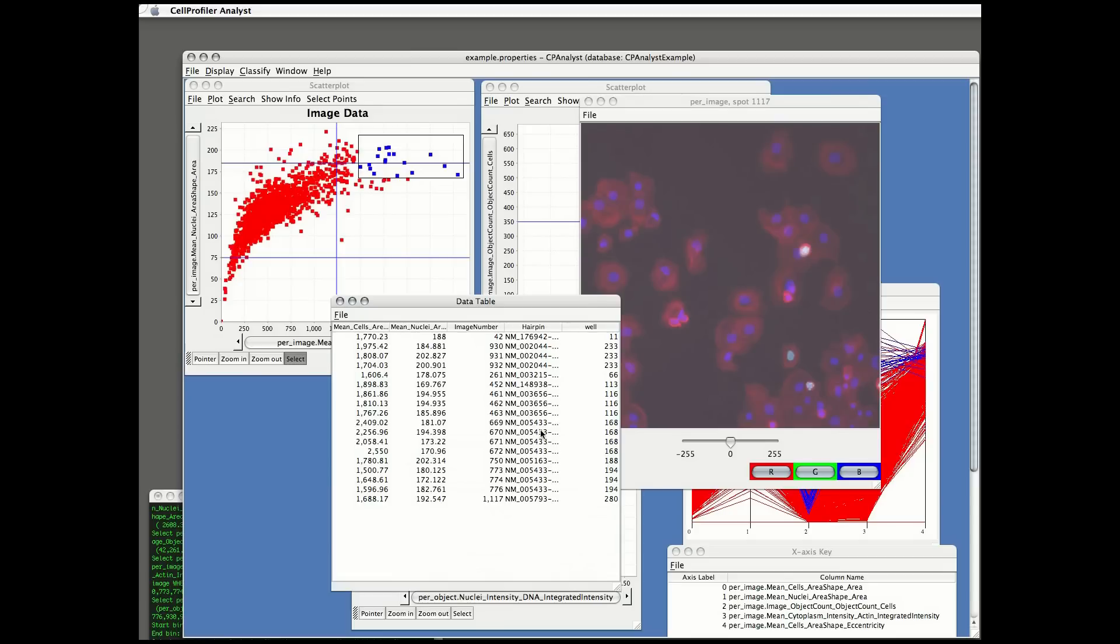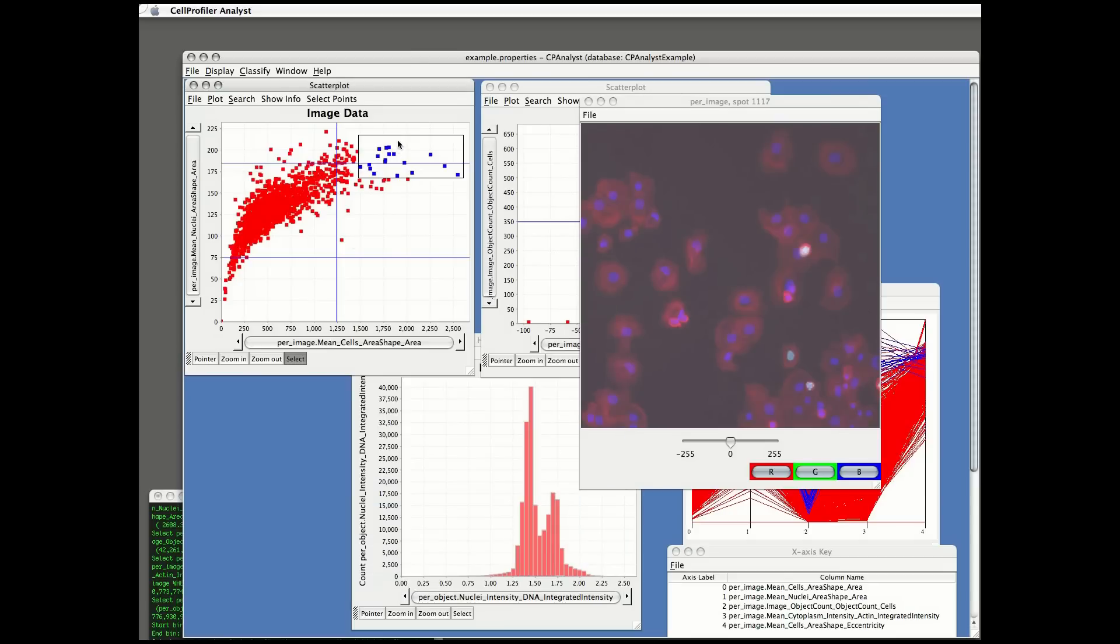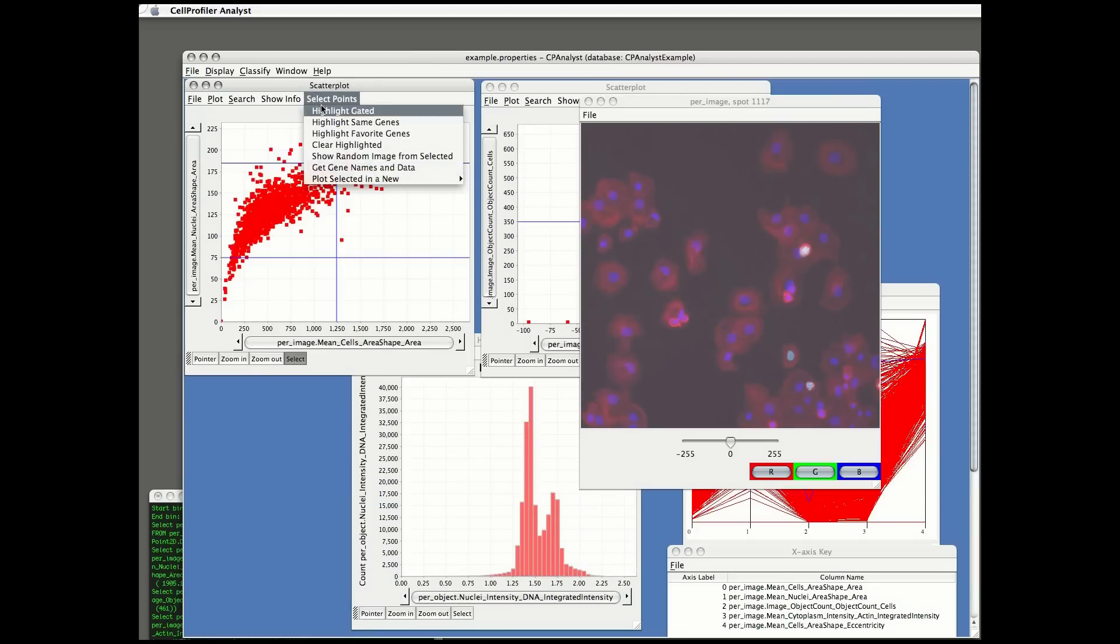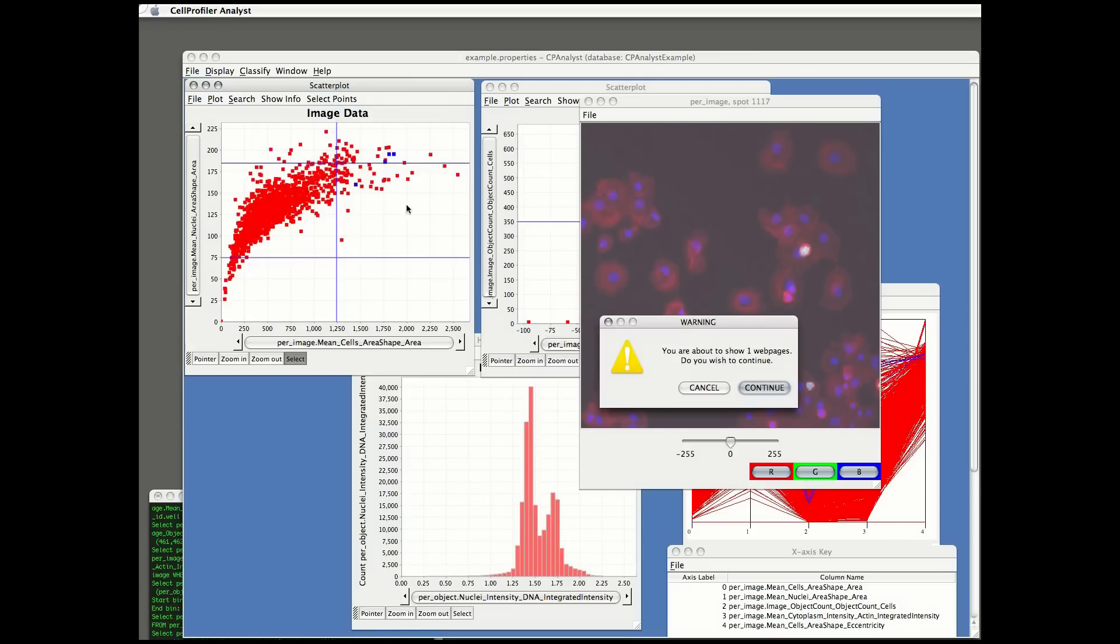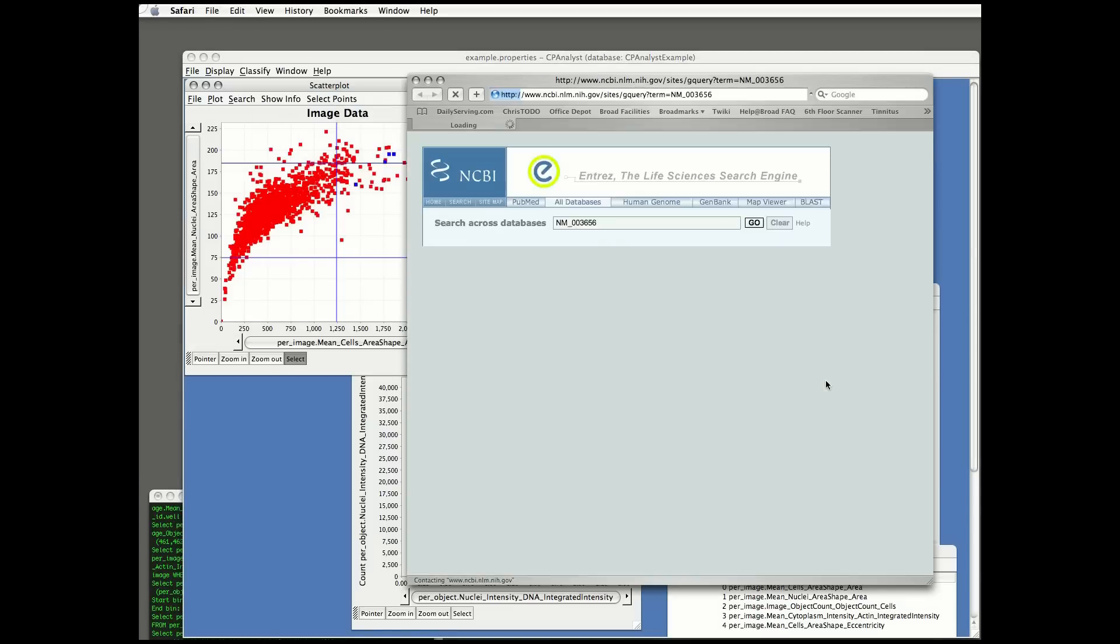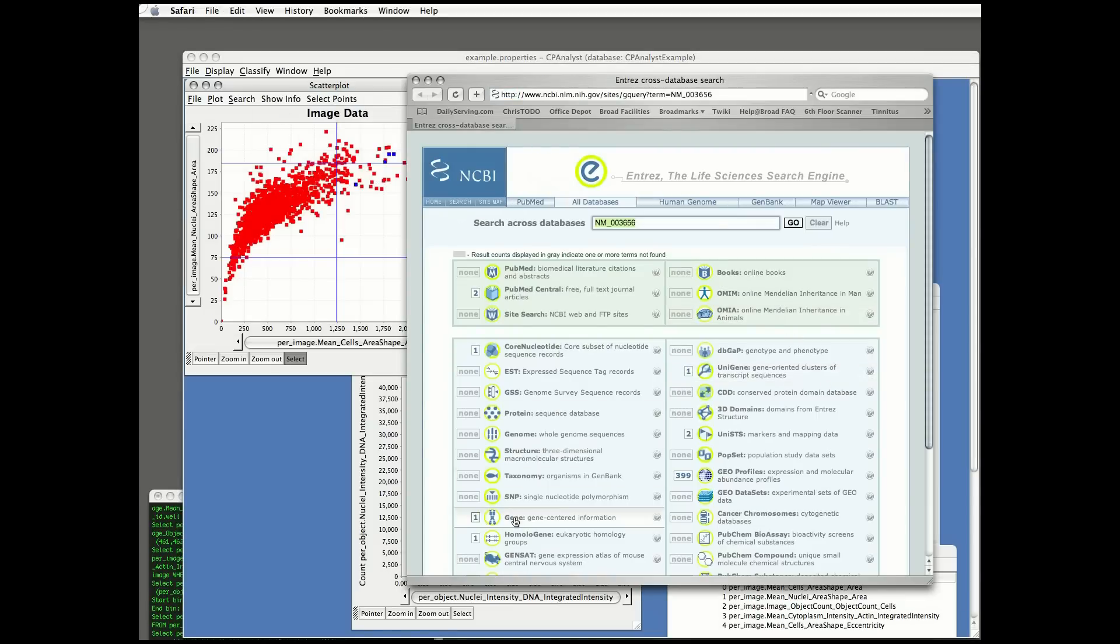In this experiment, I can see there are several replicates of a small number of interesting RNAi hairpins that produce the data points of interest. I can find replicates of an individual data point and have them highlighted. I can also ask for web information about a particular sample.